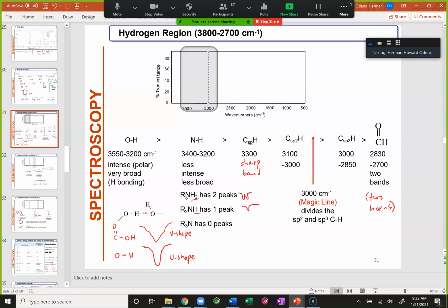And then for the tertiary amines, you'll have a flat line. So it will not help you out there. So you can identify the R part, but not the nitrogen part here, unfortunately. But if you have a nitrogen on your structure, then you know that you can still assign it. All right. Then the next 3 hydrogens are the most interesting ones.